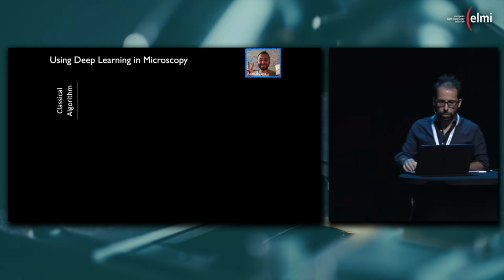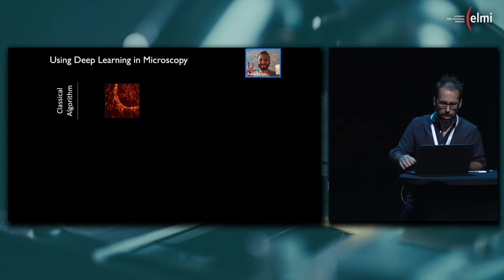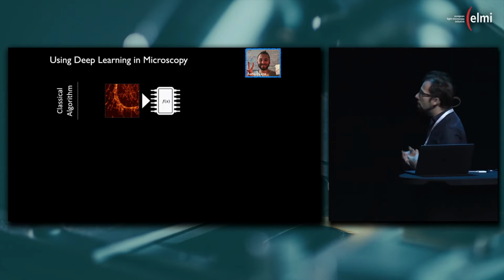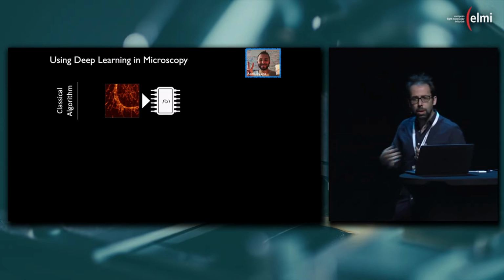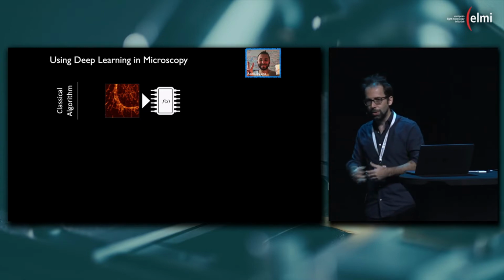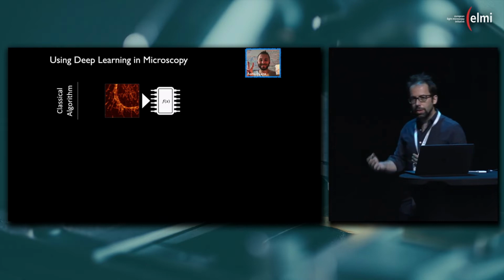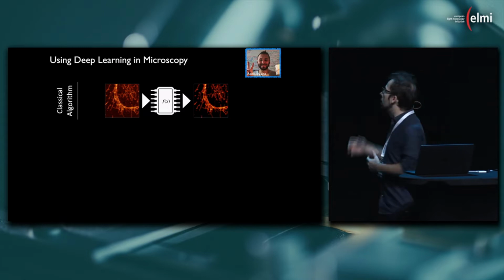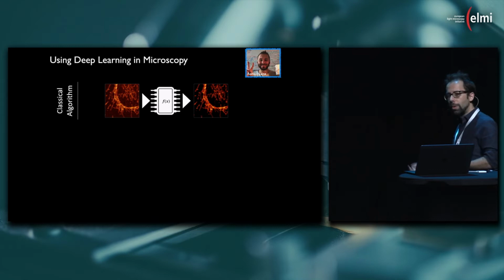And to explain a little bit how it works, I'm just going to tell you how a classical image analysis algorithm works. There, you have some kind of input, an image, for example, and then you have an already formalized algorithm. So someone developed that code that takes a few assumptions. You, as a user of that interface, of that plugin in ImageJ, take some educated guesses on parameters of that algorithm, and then that generates an output image. In this case, it would be a pre-formalized denoising algorithm where you give it the noisy image and it spits out a denoised image.